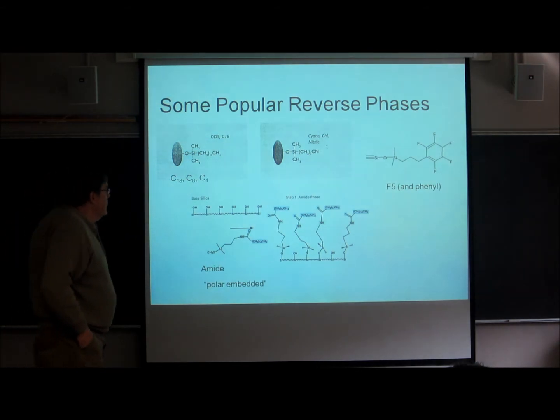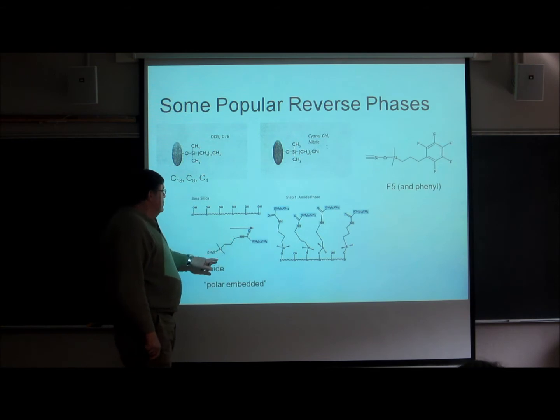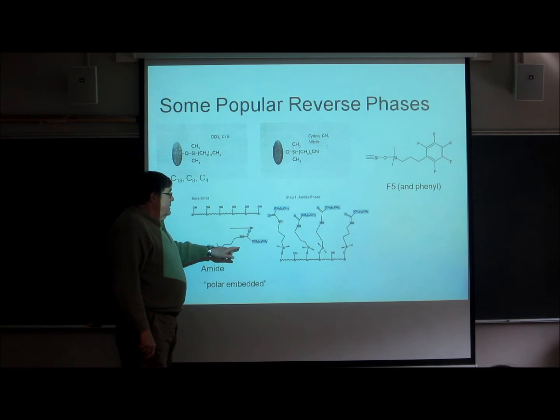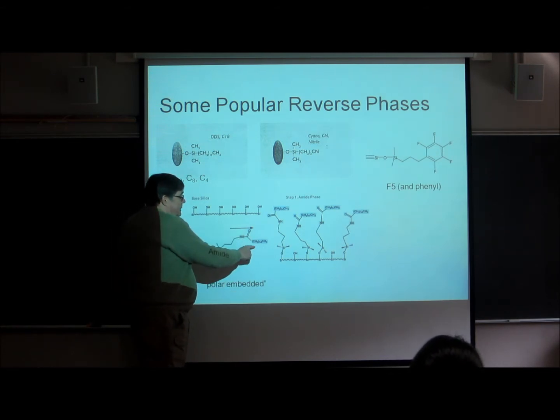Yep. Down here is an amide phase, and this is pretty interesting because the amide group is not, in this particular description, at the end of the molecule, but it's toward the middle of the long molecule.